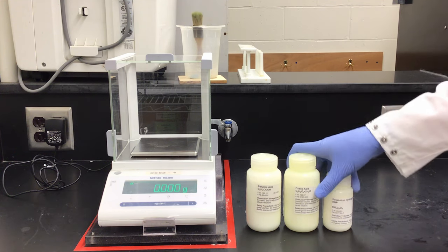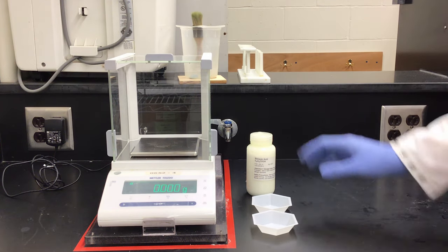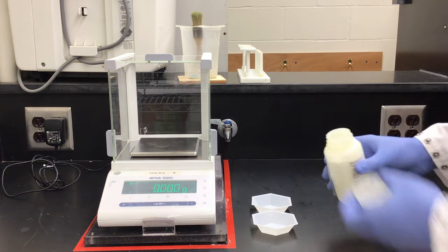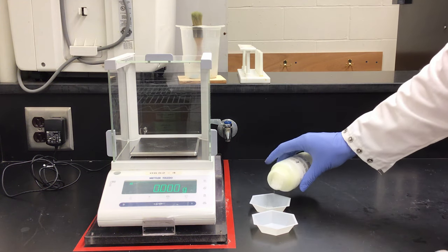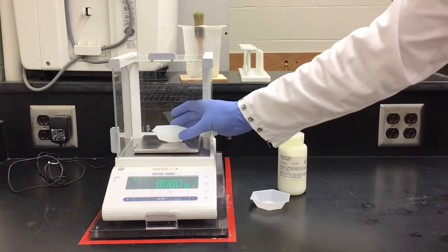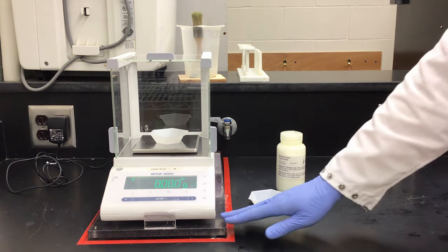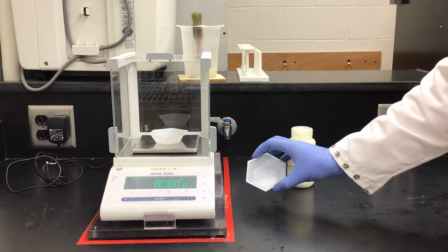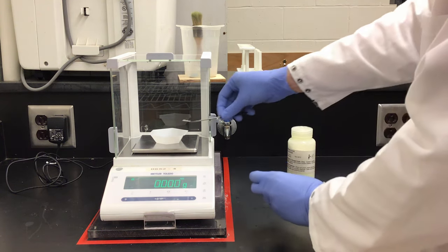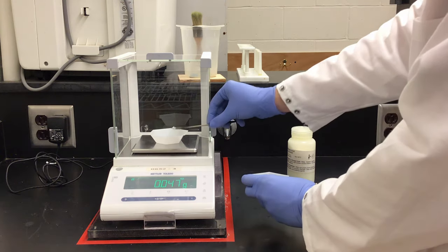We are going to start with benzoic acid and measure its mass very carefully and accurately. To do this properly without contaminating my container, I will pour some into my first weigh boat, then zero an empty weigh boat on my balance. Now I can measure out my solid benzoic acid, aiming to get around 0.40 grams.